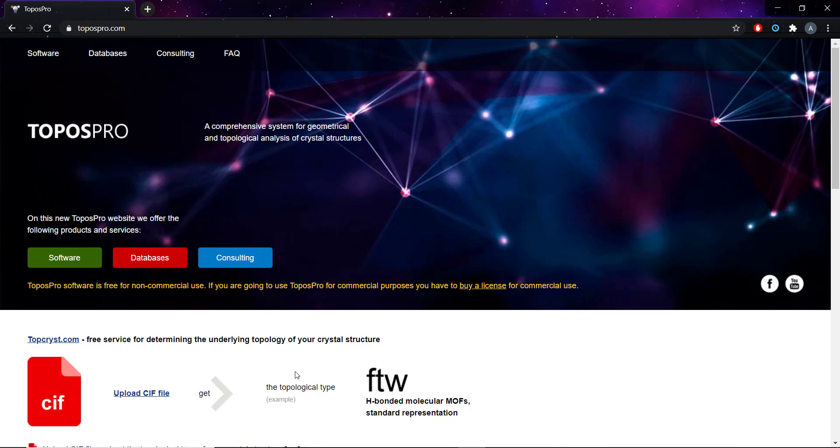This is the home page for ToposPro. There's a lot of manuals, databases and supplementary information for the software here. You can also get access to the full version of the software, but there are some license agreements to be considered if you're a commercial user.